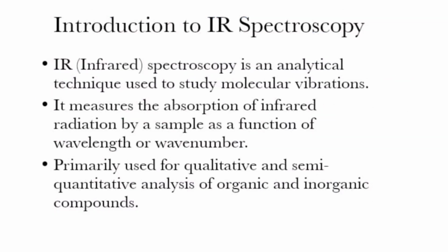Let's see the introduction to IR spectroscopy. IR spectroscopy is an analytical technique used to study molecular vibrations. It measures the absorption of infrared radiation by a sample as a function of wavelength or wave number, primarily used for qualitative and semi-quantitative analysis of organic and inorganic compounds.